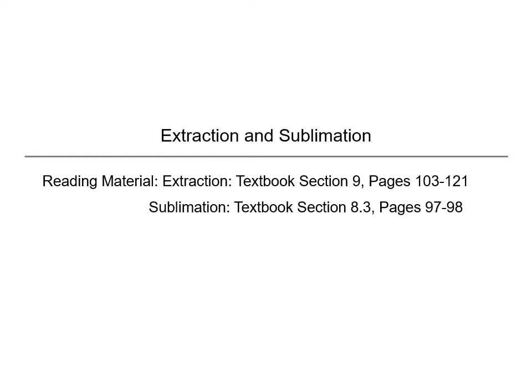In this lecture, we will be discussing two different techniques in chemistry used to take out certain compounds and purify them via sublimation. As always, please do read the textbook. There's a lot of very interesting and useful information in there.